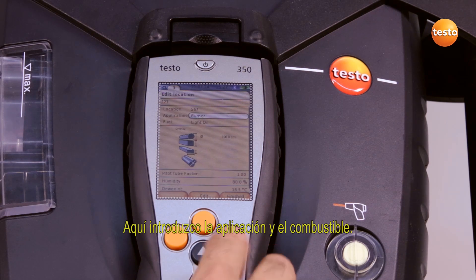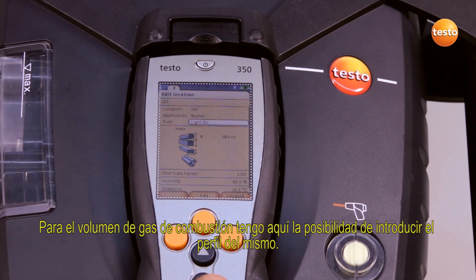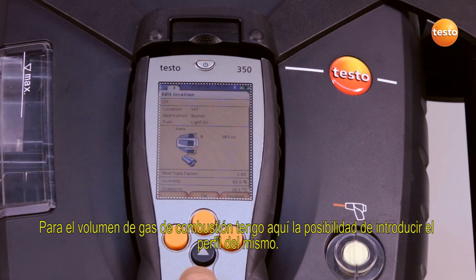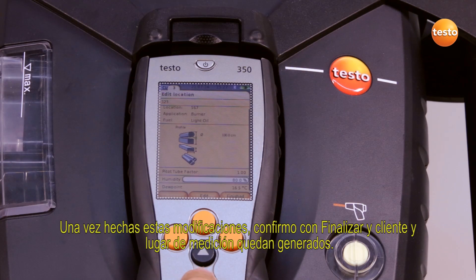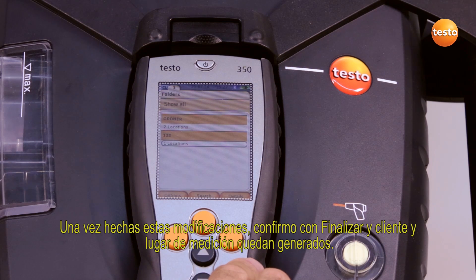Here I enter the application and the fuel. For the flue gas volume, I have the option of entering the flue gas profile. Once I have carried out these changes, I confirm with finish and the customer and measurement location are saved.